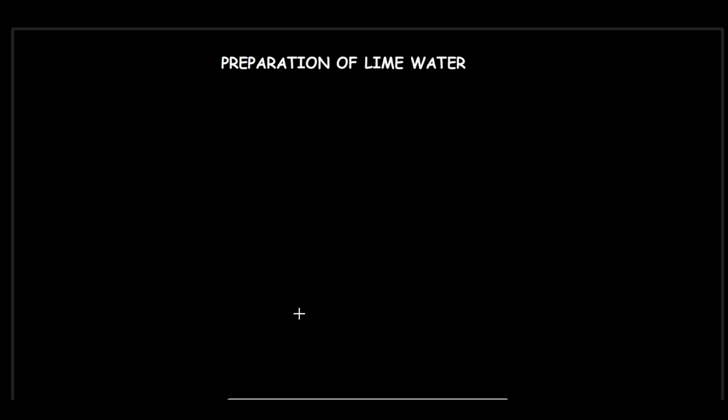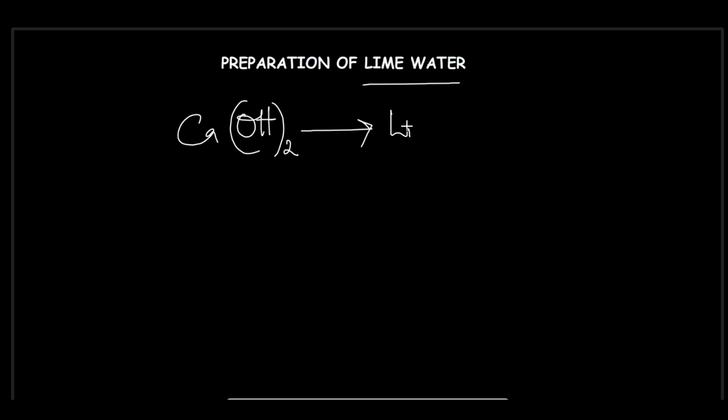Today, I'll be explaining the preparation of lime water. So, when you hear the word lime water, it is a saturated aqueous solution of calcium hydroxide. A saturated aqueous solution of calcium hydroxide is lime water.